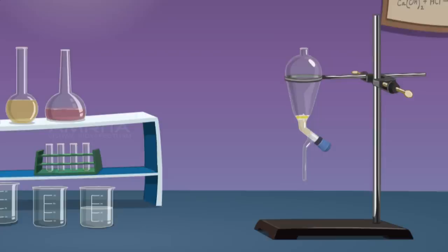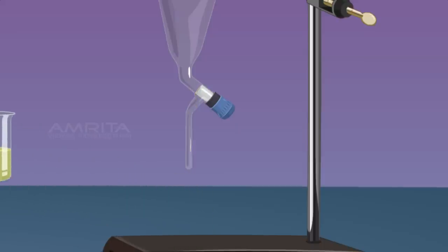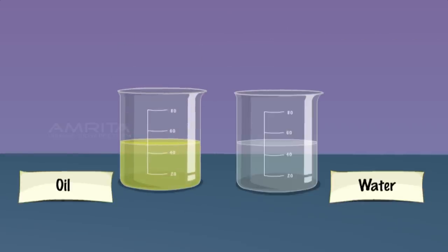Take another beaker and place it below the separating funnel. Open the stopcock and now collect oil from the separating funnel. The immiscible liquids separate out in layers depending on their densities. The denser liquid falls to the bottom forming the lower layer and the lighter liquid forms the top layer. Water is denser than oil.